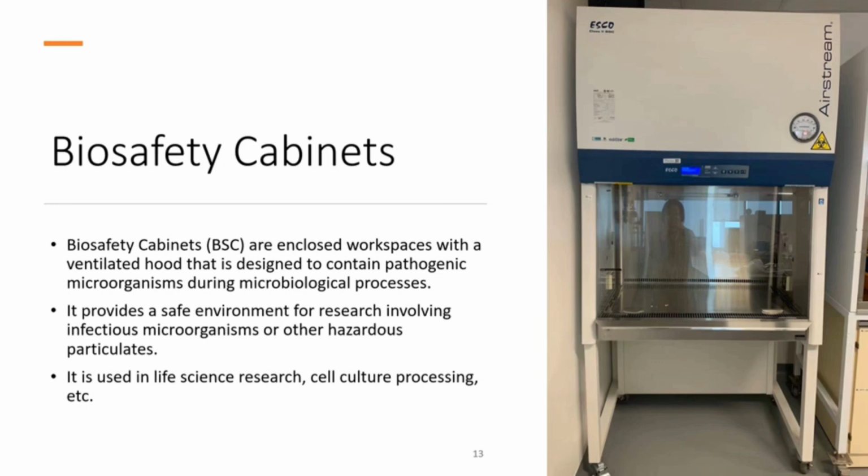BSCs are used to handle hazardous biological agents, for example, infectious microorganisms. Hence, it is typically being used in life science research, cell culture processing, etc.